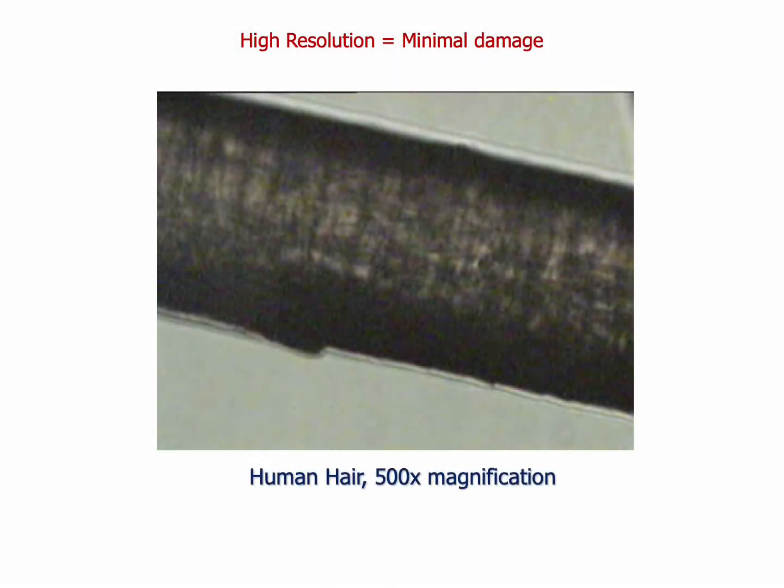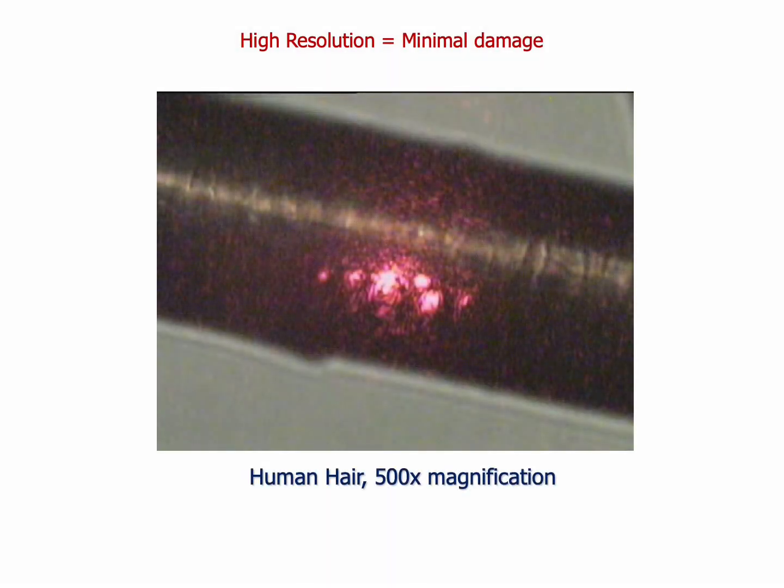The spatial lateral resolution of the LIBS measurements is one of the more interesting advantages of the technique. It corresponds to the dimension of the microcrater left by the laser on the sample surface. Here, a computer-enhanced enlargement of a typical laser crater is shown. Its diameter does not exceed 100 microns, which is practically invisible to the naked eye.